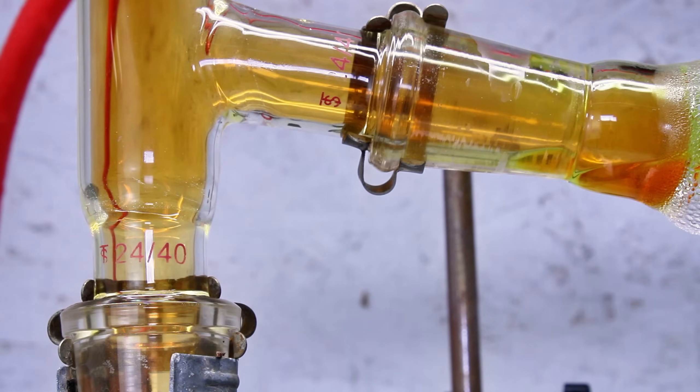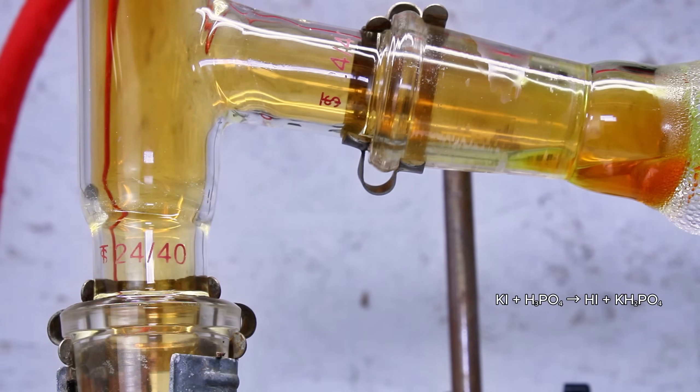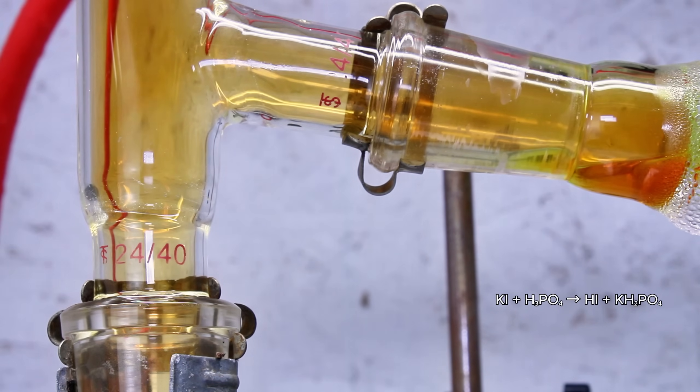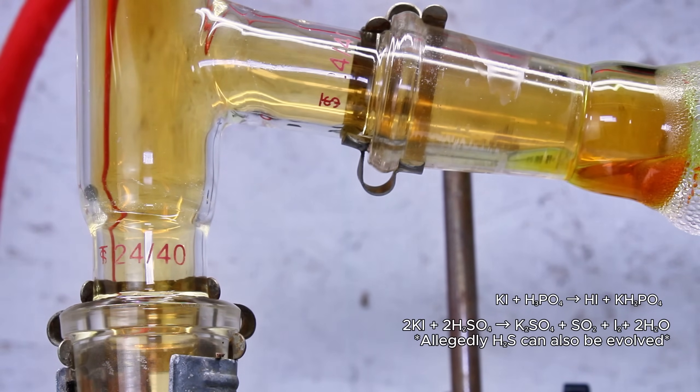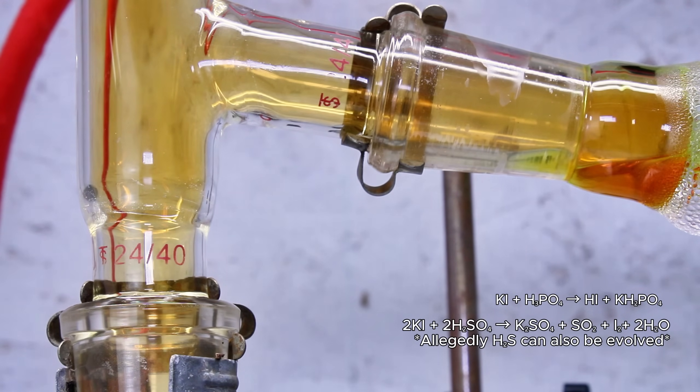On a side note, this is the exact principle that allows for the formation of the very strong hydroiodic acid from potassium iodide and the fairly weak phosphoric acid. And in fact, this is actually one of the few viable ways to do this reaction, since sulfuric acid would simply be reduced by hydroiodic acid to hydrogen sulfide and elemental iodine.